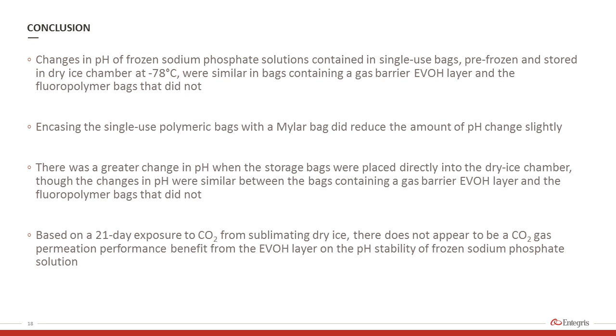In conclusion, the changes in pH of frozen sodium phosphate solutions contained in single-use bags, pre-frozen and stored in dry ice chambers at -78 were similar in bags containing an EVOH layer and bags that did not have an EVOH layer. Encasing the single-use polymeric bags with a Mylar bag did reduce the amount of pH change, but just slightly.